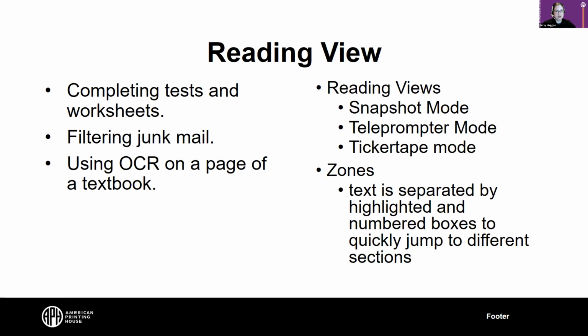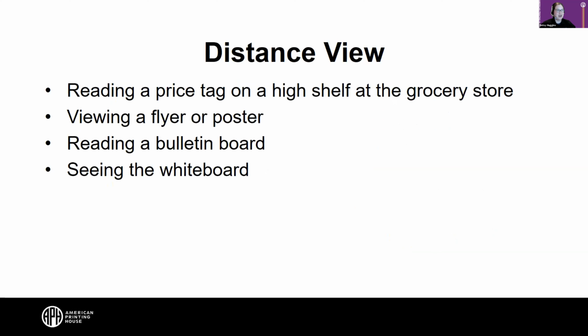Well, we've got lots of people in the chat asking about distance viewing. So let's go to the next slide and really dig into the distance view of Juno.